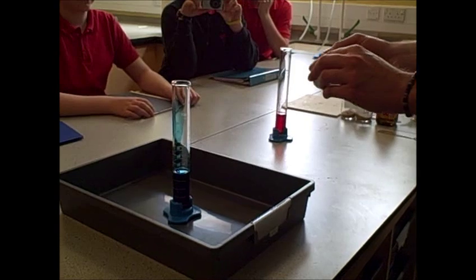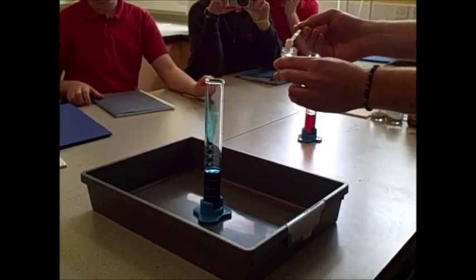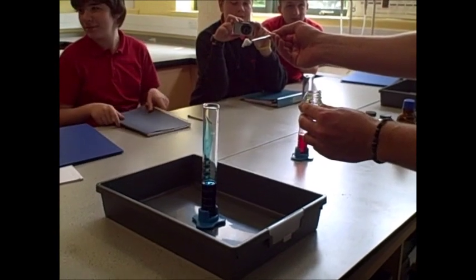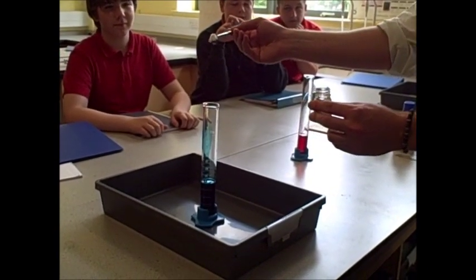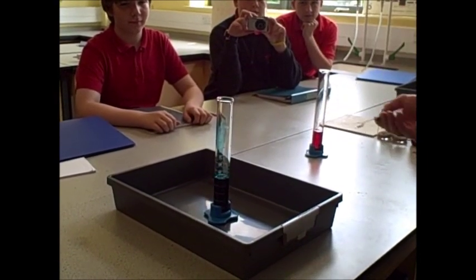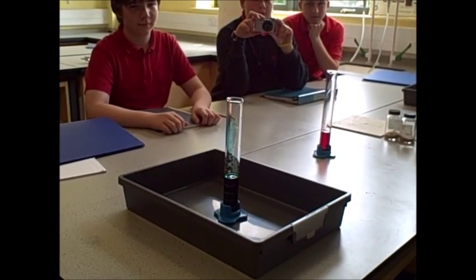This stuff is called potassium iodide. We've used it in solution in that very first experiment we did — the first lesson. It's part of the one which went bright yellow. So if we stick this potassium iodide into here, we'll keep an eye on it.